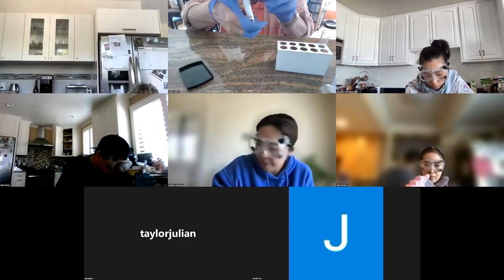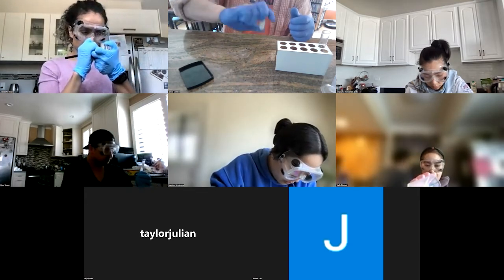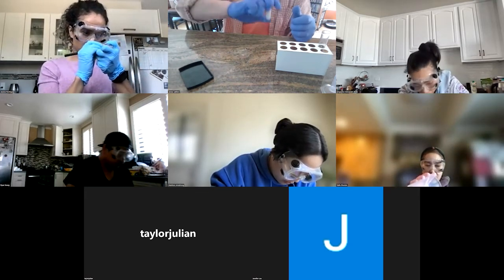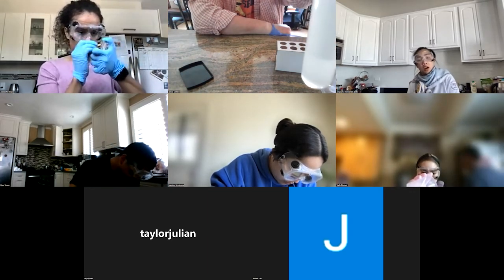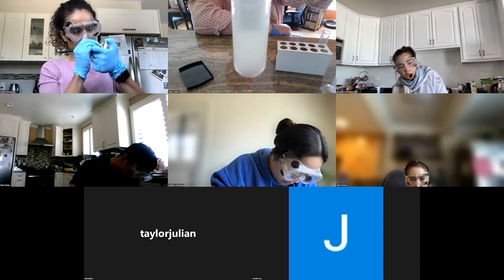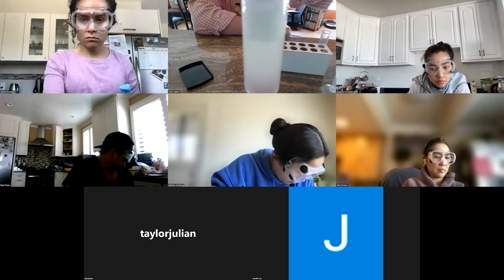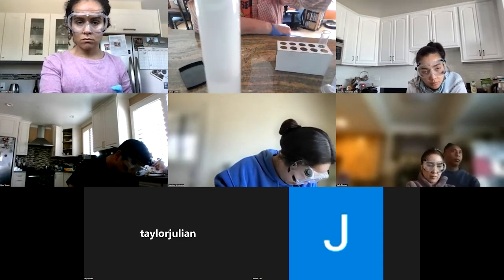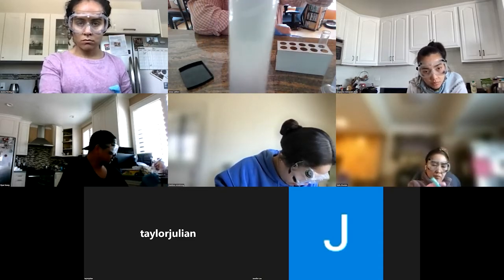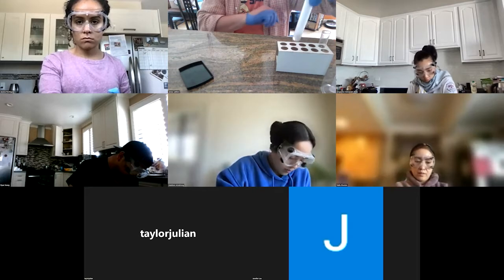But let's see if it will disappear when we shake it. And it's gone. Yeah, you don't see the oil. There's no oil, no separation there. That's what soap's supposed to do.